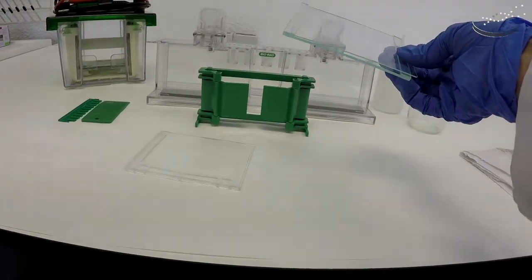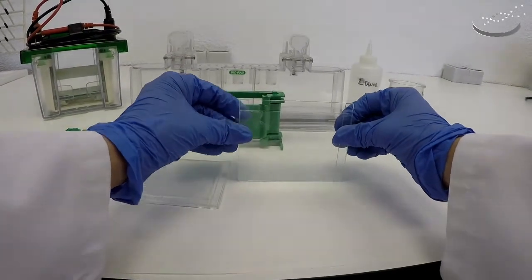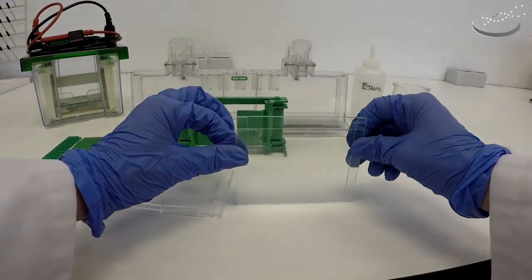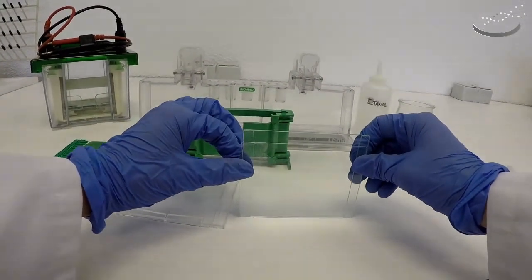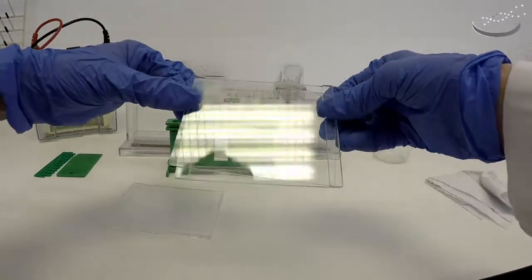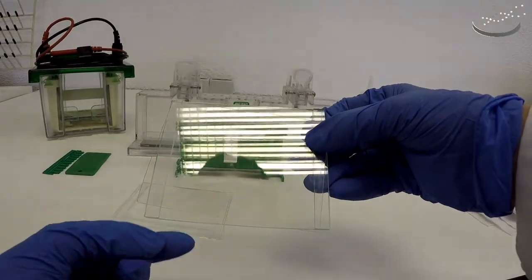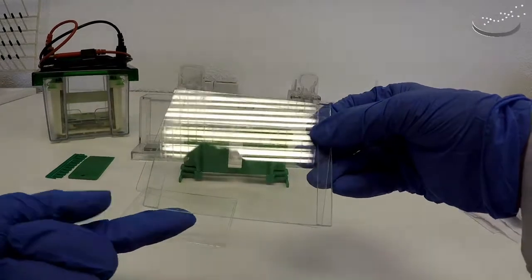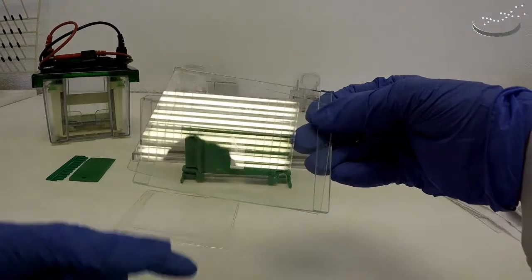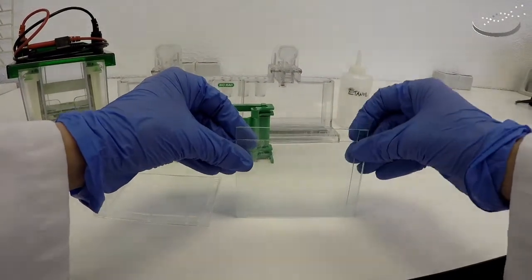We're going to put the clean face of the small plate onto the back plate with the spacers. Then we want to make sure that they are perfectly aligned, so we have to put them onto a flat surface. It's crucial that the two plates are perfectly aligned, because if they're not even, when you put the liquid gel solution inside it will leak out and won't have time to polymerize. This is why it's so important to place the two plates together on a level surface and make sure they're perfectly aligned.